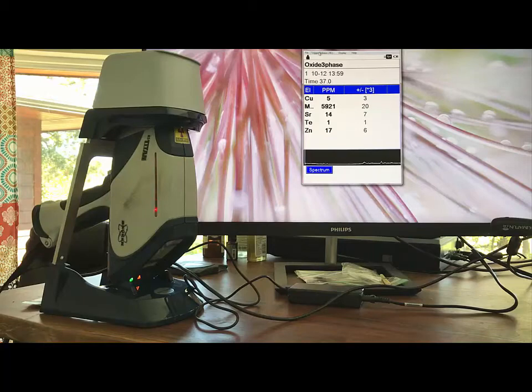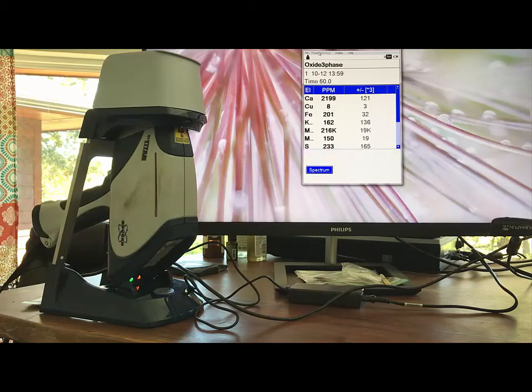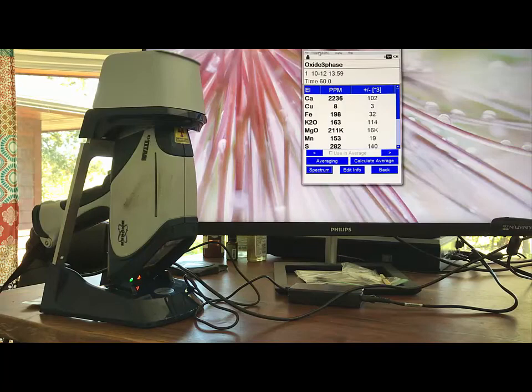We have to test the stabilized soil, the virgin soil, and the chemical stabilizer in order to mathematically determine how much calcium is in the stabilized soil. This is a very simple process, and this technology is extremely accurate and precise. We are currently refining the method at which we sample and process our soil. Now you can see that the calcium reading is over 2,000 parts per million.